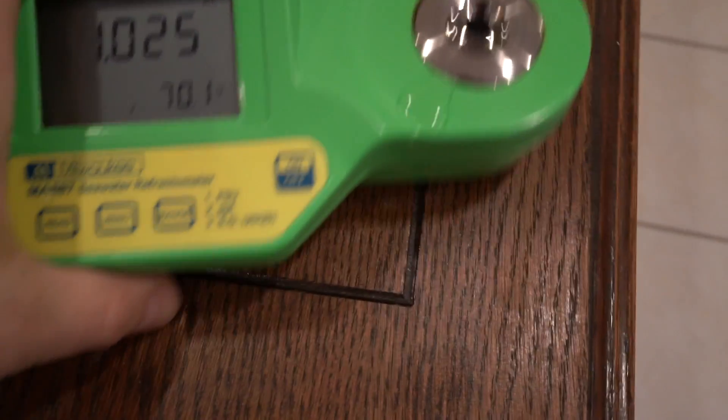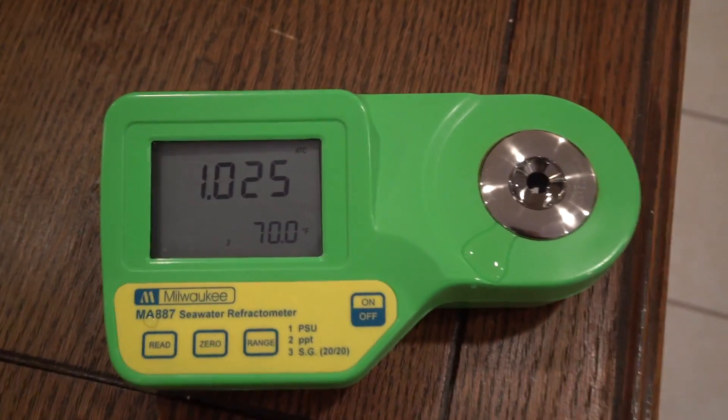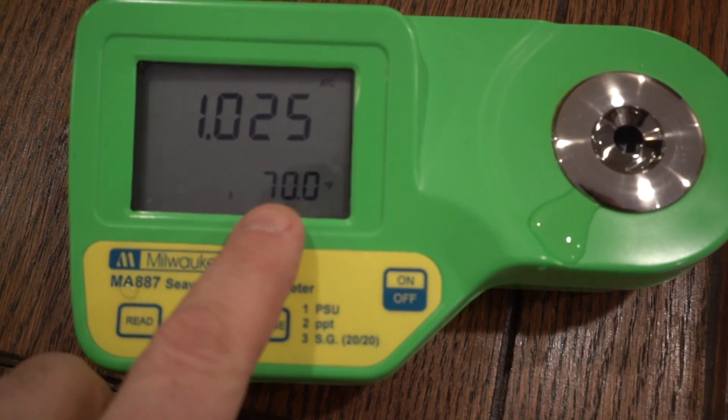So I went back to the Hanna. I left the water in there to check the temperature, and it never moved — it stayed at 70, which I guess we'd expect. It probably comes down to room temperature pretty quick, such a small body.